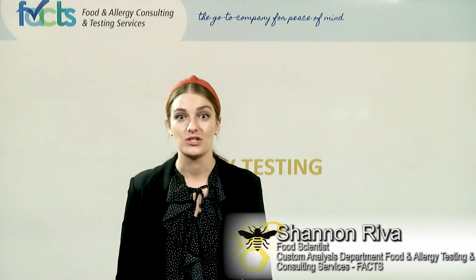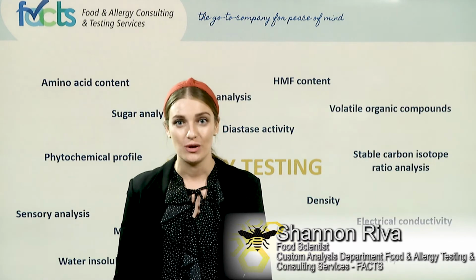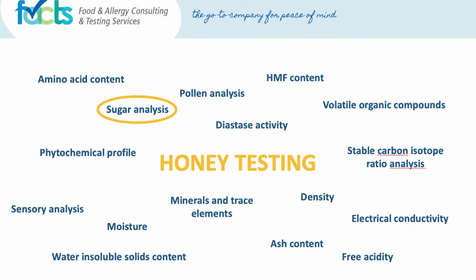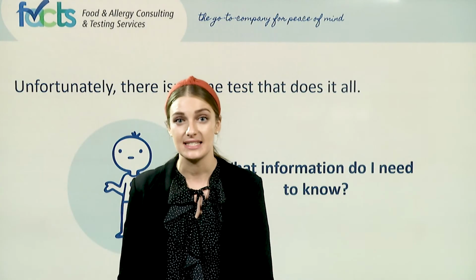So let's say you have a sample of honey that you'd like to test, but after a quick internet search, you're bombarded by the amount of test options that are out there. Let's say you decide to go with a sugar analysis, and again, there are so many different methods that can be used to determine the sugar profile of a honey sample. So how do you know which one is the right one to pick? Unfortunately, there isn't a test that does it all.